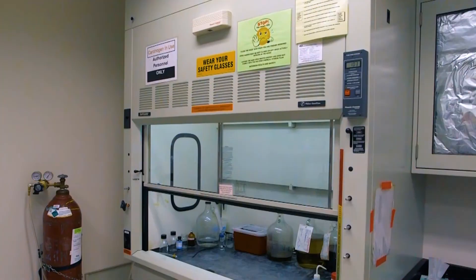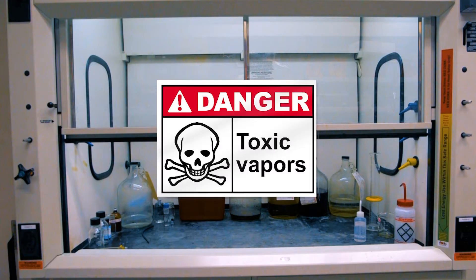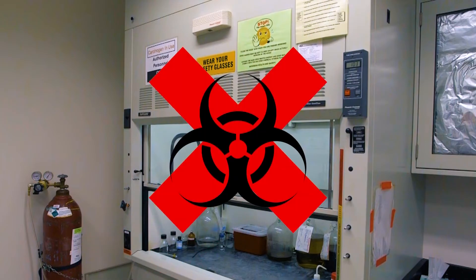Fume hoods are the most common type of hood found in ASU laboratories. The fume hood is designed to protect the user, but does not protect the sample. Fume hoods protect users from volatile chemicals, toxic vapors, and flammables. A fume hood pulls air from the lab through the front sash of the cabinet and exhausts it outside of the building. A fume hood is not suitable for work with biological materials because it does not protect the sample or the user from biological hazards.